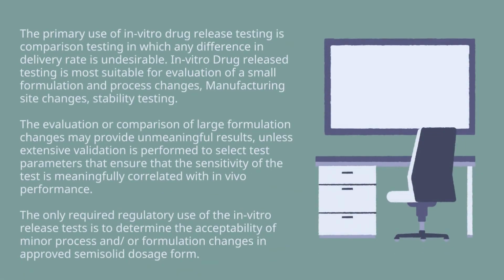The primary use of in vitro drug release testing is comparison testing, in which any difference in delivery rate is undesirable. In vitro drug release testing is most suitable for evaluation of small formulation and process changes, manufacturing site changes, and stability testing.